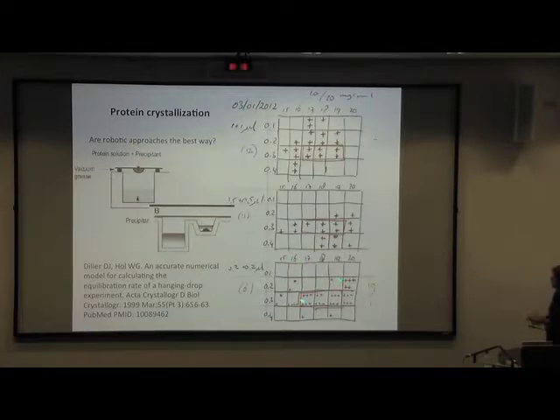So this is the volumes that you would use in the crystallization plate. I actually used to set the crystallization plate. And this is a bit larger volume in the larger plates, and that's the manual setup. You can see that the different volumes, the way you set up, greatly affect how it crystallizes, and even reduce sometimes the chance of getting a hit.